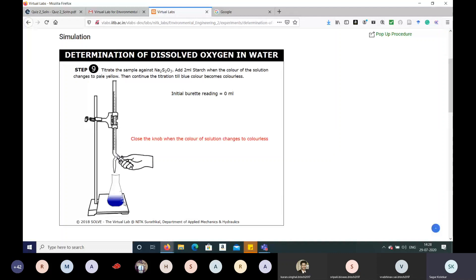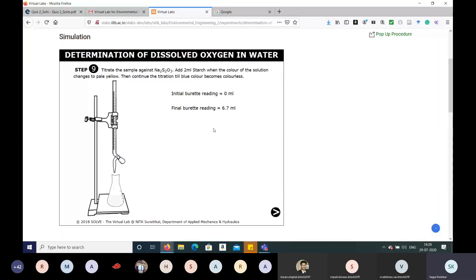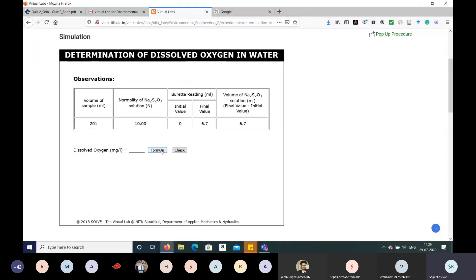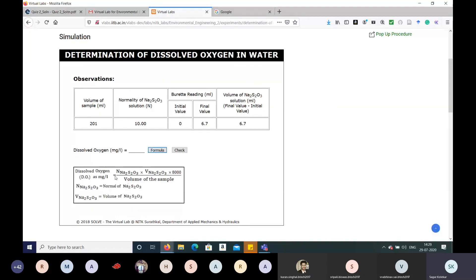Continue the titration until the blue color turns colorless, then close the knob. The burette reading obtained is 6.7 mL. Using the given formula — which involves the normality of sodium thiosulfate (N), volume of sodium thiosulfate (B), and volume of the sample — do the calculation to find the dissolved oxygen value.